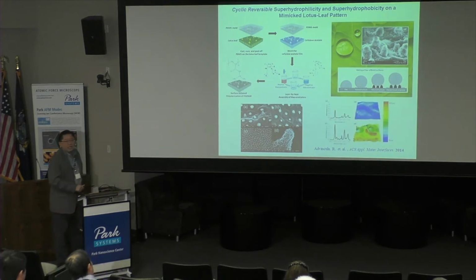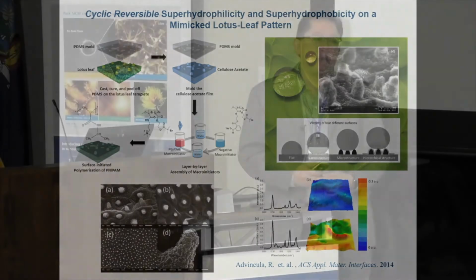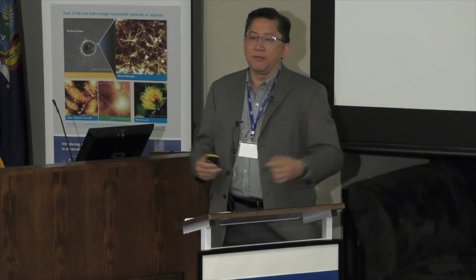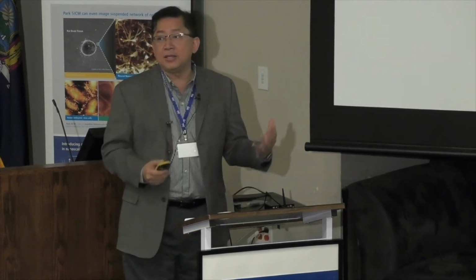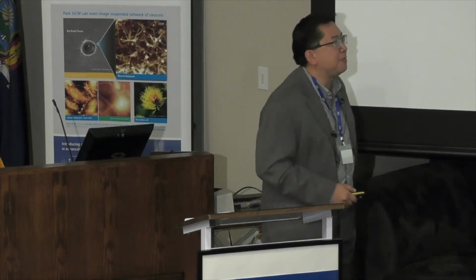So imaging is very important. This was actually using IR because we want to see the constitution. In fact, a challenge to you, the AFM community, is to get more spectroscopy out of AFM, get more chemical information out of AFM. If you can do that, that will open a lot of features that are not reported before. And several companies have been trying to do that. So AFM plus spectroscopy is a very good marriage.